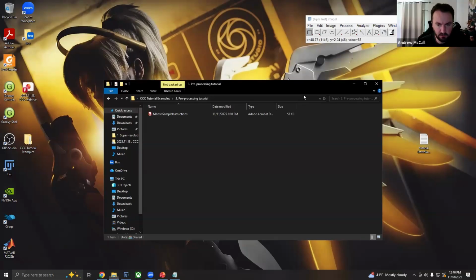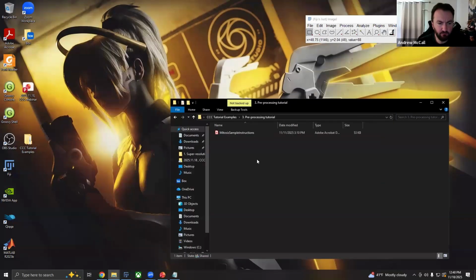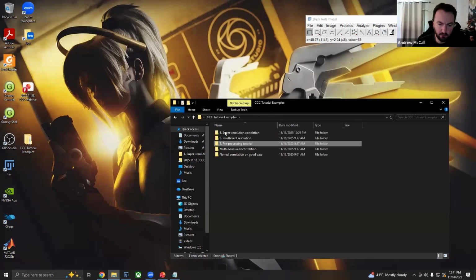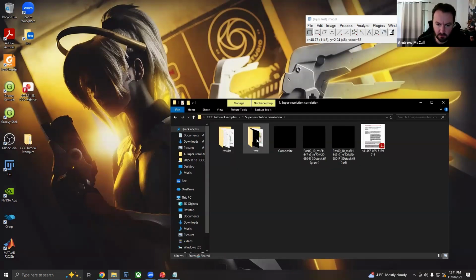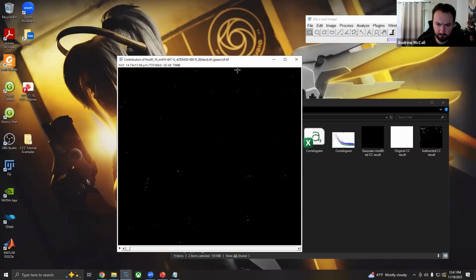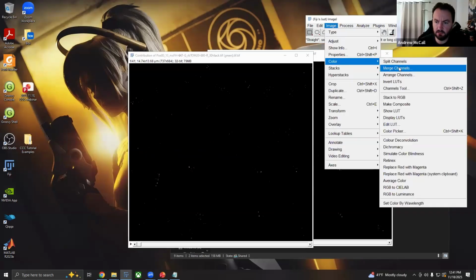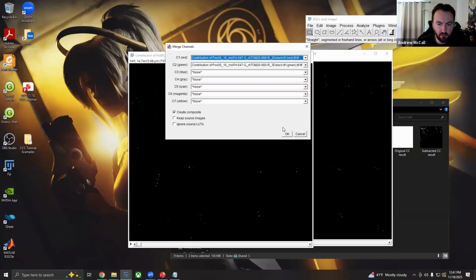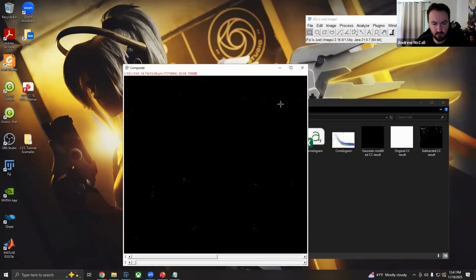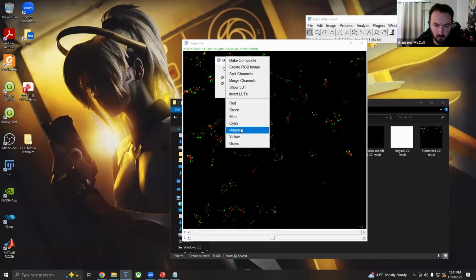So the contribution image, sorry, I should have read that out loud. The contribution image is intersection and of two channels for visualization purposes only. And no, you don't have to use it just for visualization purposes. So actually, let's go ahead and take a look at these two contribution images. And they do come out as two separate stacks. Sorry about that. It's just a lot easier to program that way. But we can go ahead and merge these. And then I will change the channel here. So, oops, that was the wrong one.